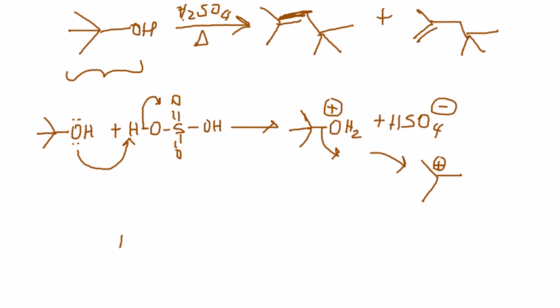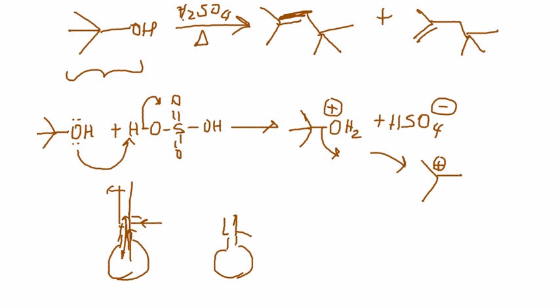What that means is that you will have a round bottom flask. You're going to connect it to the reflux condenser, water in, water out. So you're going to allow the vapors to come back, fall back in, again rise up, fall back in. So it's going to continue to take place for a long period of time. What you did last semester, however, was that as the reaction takes place, you connected this to a still head, which was connected to a receiver flask, and then you collected your product.